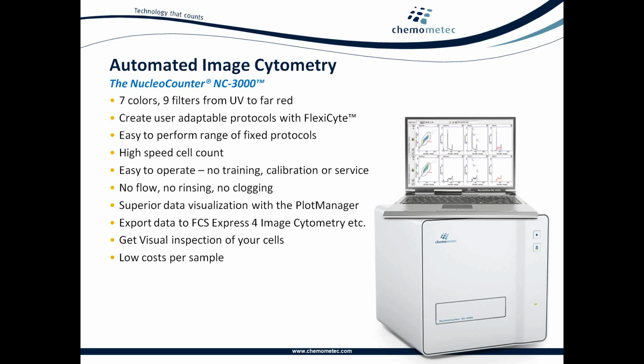create protocols to look for different markers. We've seen different CD markers being used, and the mitochondrial tracker, and so on. And on top of that, we have a range of fixed protocols, so different apoptotic protocols, cell cycle protocols, GFP transfection efficiency protocols, and so on.